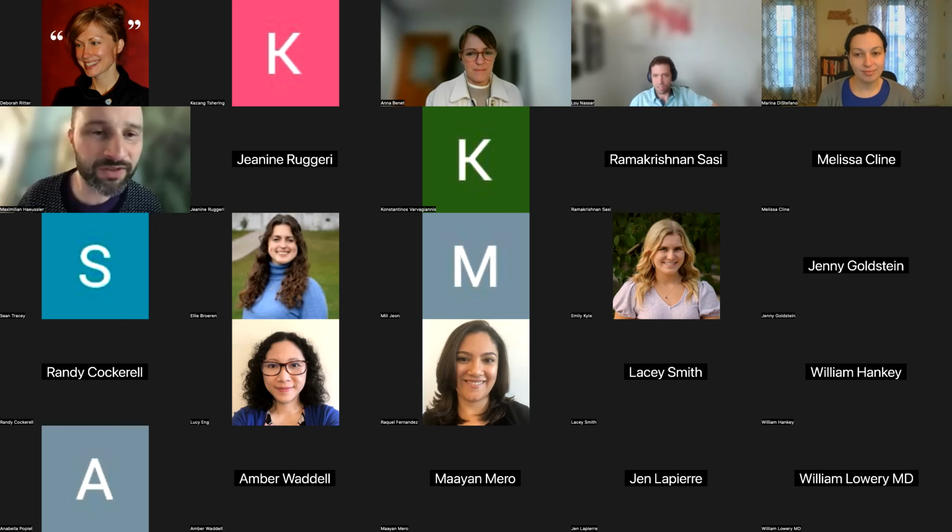There's another question in the chat about hotspots. I'm just looking at the website, and the hotspots are in PM1. If someone has comments about how important that would be as a track... I just want to throw that out because I'm looking at the website, and I think there's no machine readable version of this. It seems like English text where you have from and to amino acid.